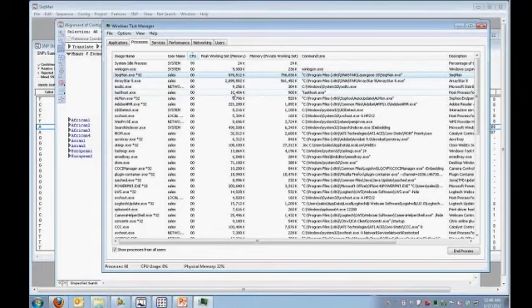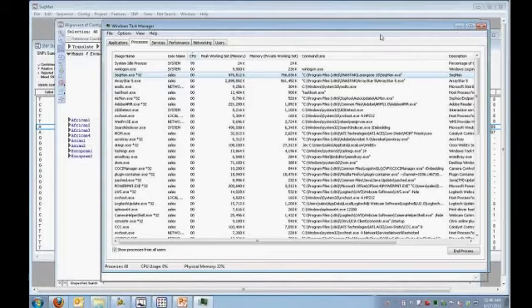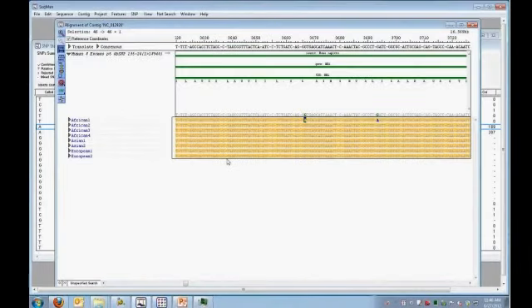And so I can open this on a laptop computer. It might take a few minutes to load the project, but once it's loaded, the memory footprint is very small. And again, that's attributed to the BAM format. The way BAM formats work is only what you see on this screen is what's in the memory. And so it allows me to have these large assemblies work efficiently.